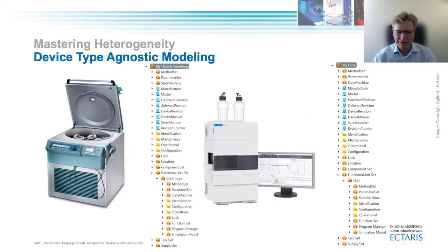How do we master heterogeneity with our device type agnostic modeling principle? To demonstrate this, let's compare the LADS OPC UA model of the centrifuge I just presented to you with the model of a completely different device, an HPLC. Although the devices are different, they look very similar from a LADS connectivity point of view.